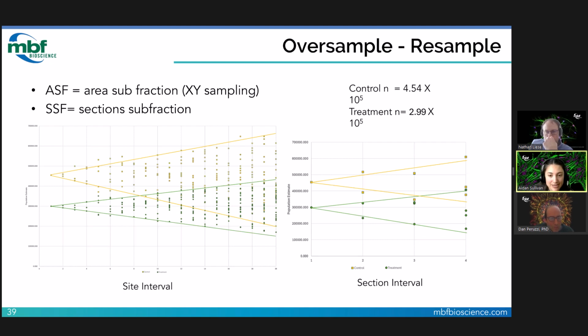Close to overlapping. Would you feel comfortable decreasing your sampling sites by a factor of 5 after looking at this data? That is what you have to decide. These tools give you this data, and then you look at the data and you do what you feel comfortable with. Okay. Yeah, I think that I might stick with reducing my sampling site interval by a factor of 2 instead.